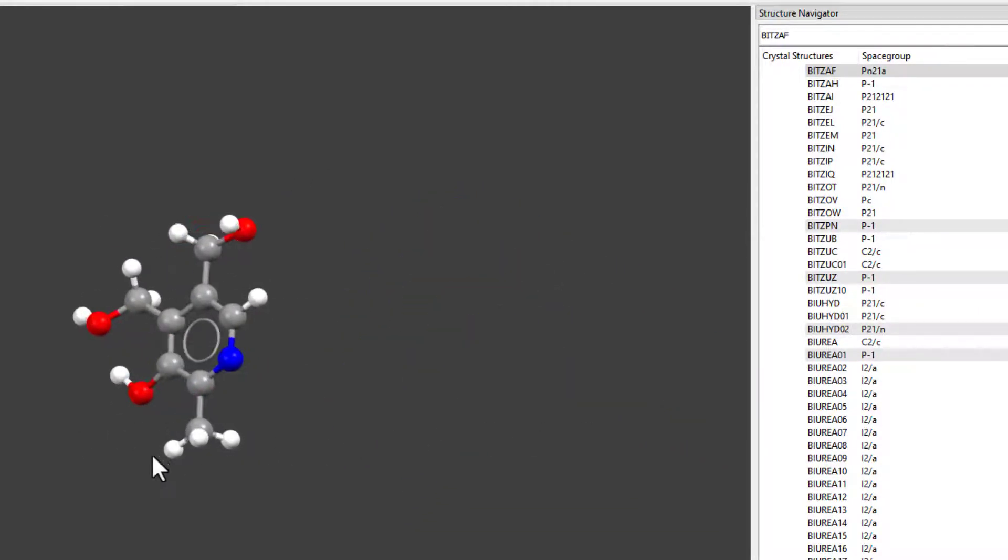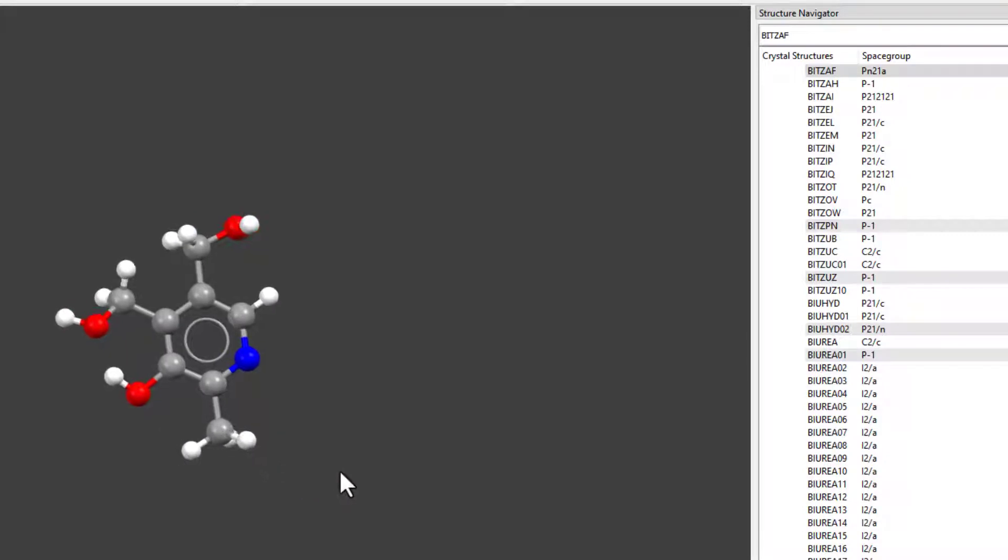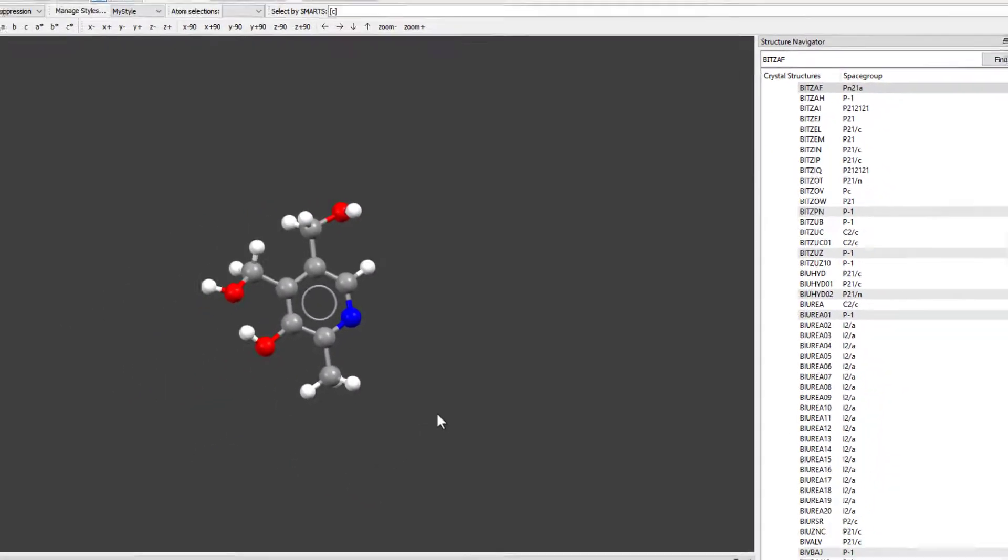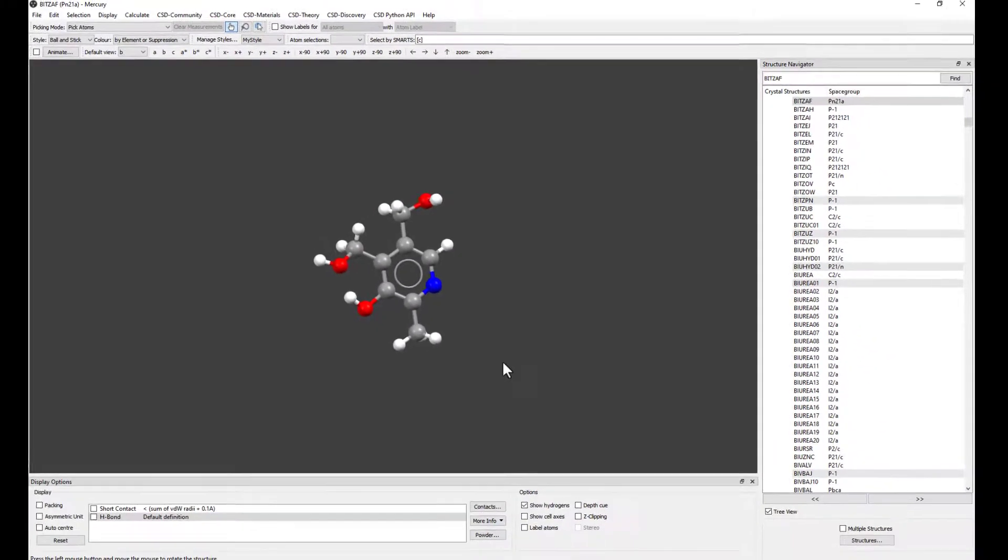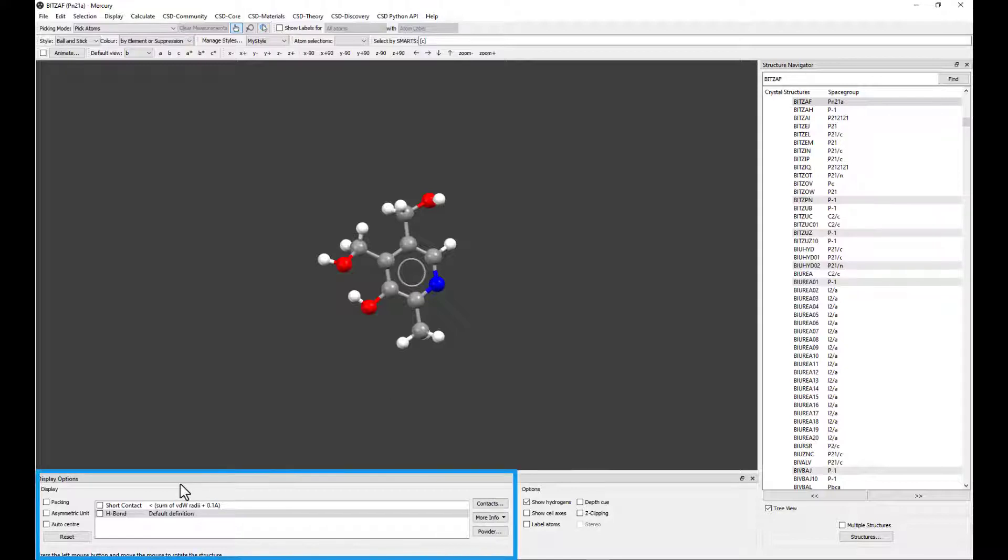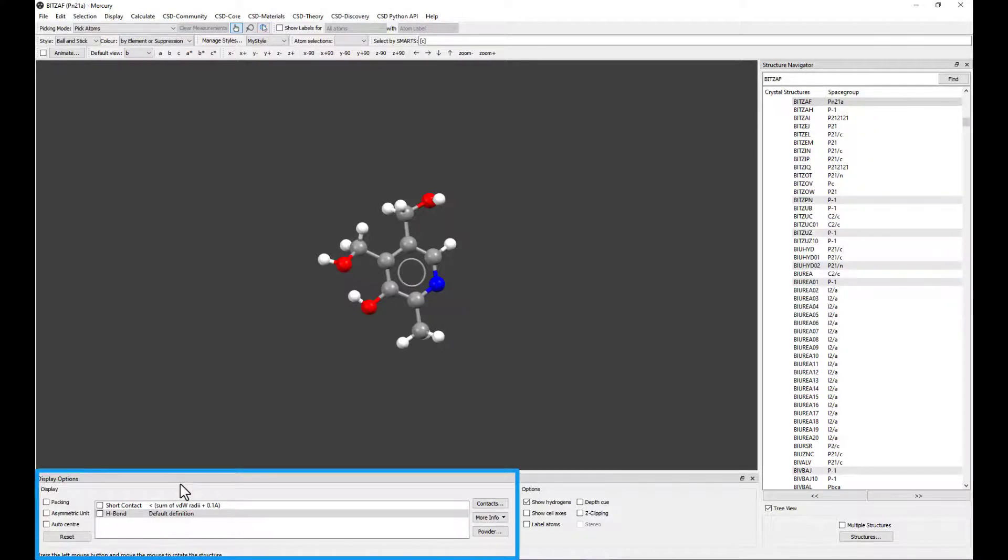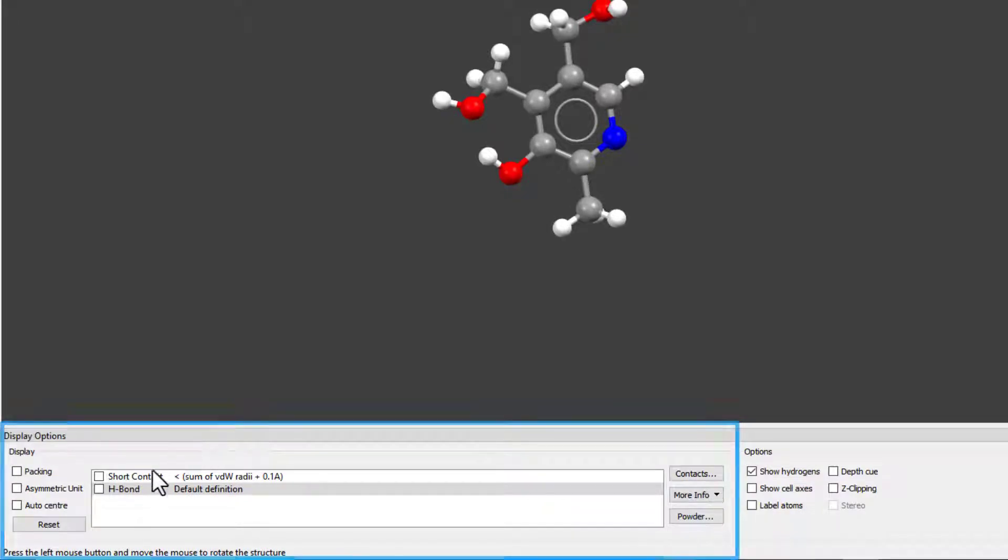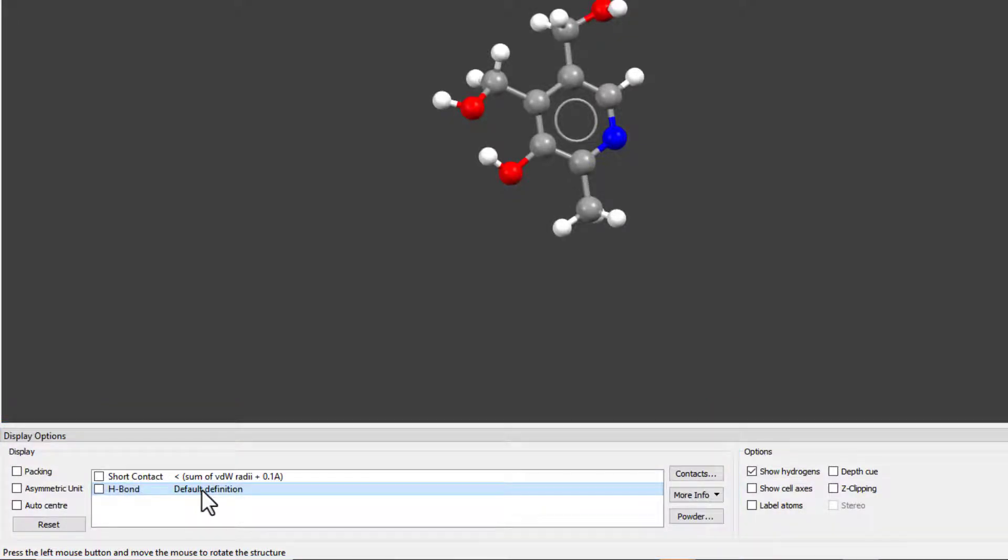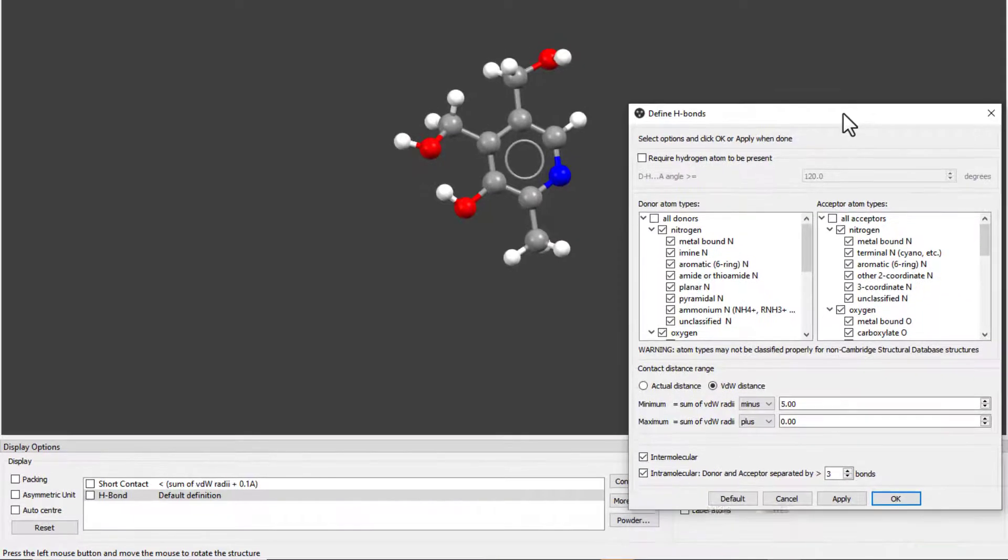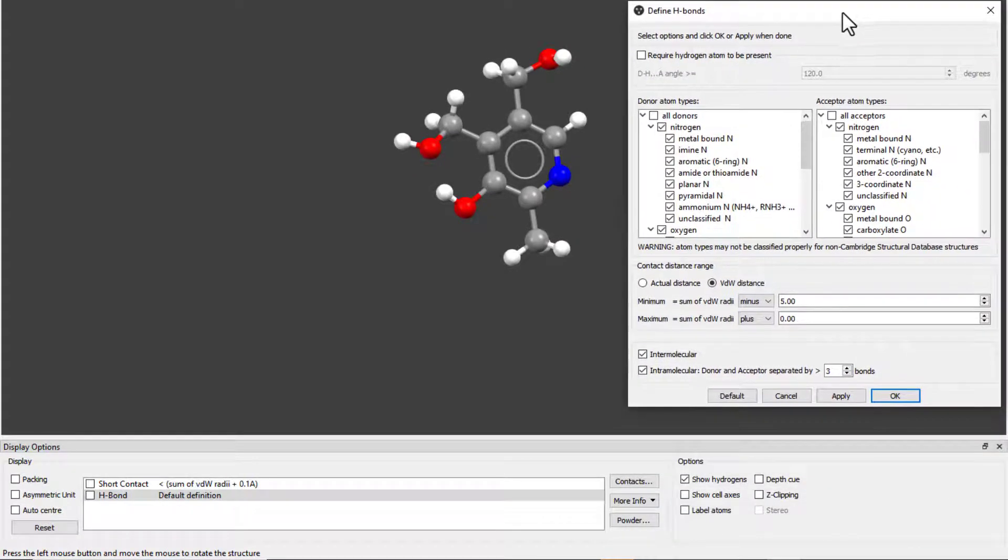Before turning on the hydrogen bonds to visualize them in the structure, we will see the definition used in Mercury. In the display options box at the bottom, we see H-Bond Default Definition. Double-click on the default definition to bring up the Define H-Bonds window.